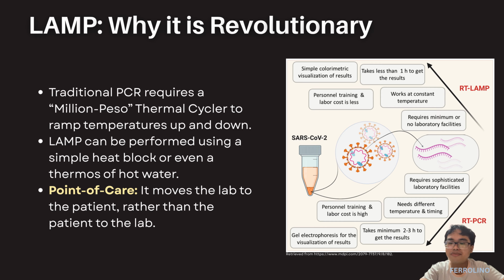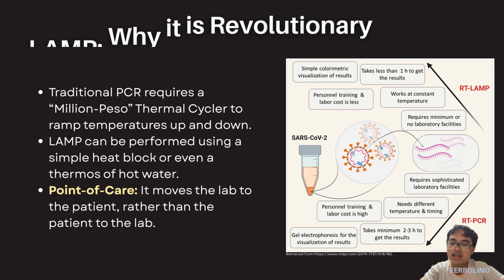A critical fact for field parasitology is that BST polymerase is significantly more resistant to inhibitors than the Taq polymerase used in standard PCR. Clinical samples such as stool or crustacean tissue often contain humic acids, polysaccharides, and heme byproducts that neutralize the Taq polymerase. Data also indicates that the LAMP can often be performed in crude lysates, which refers to the samples that have undergone minimal processing, thereby bypassing the need for expensive and time-consuming spin column DNA purification kits.